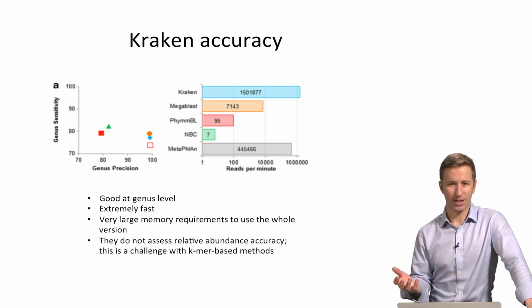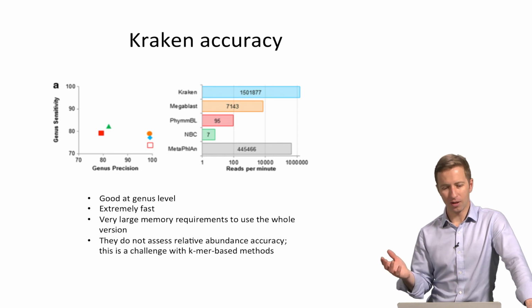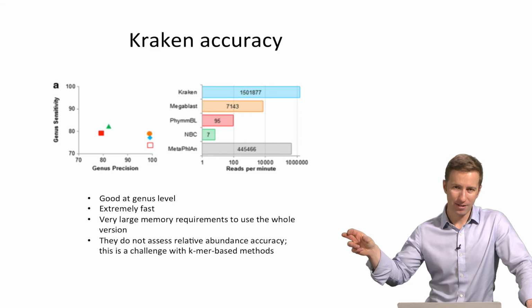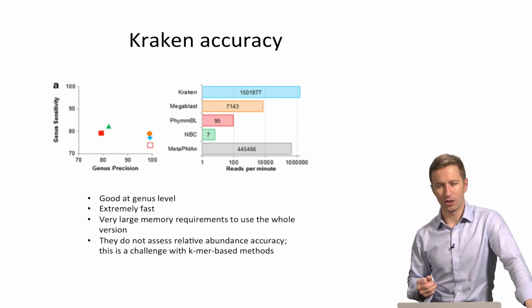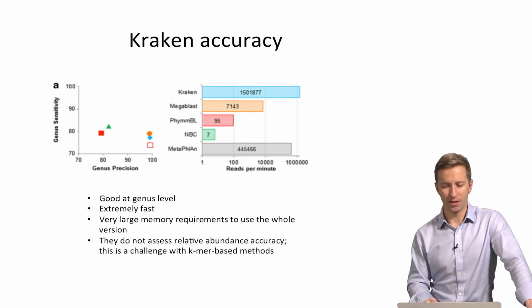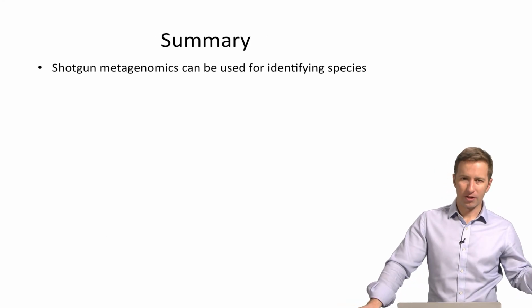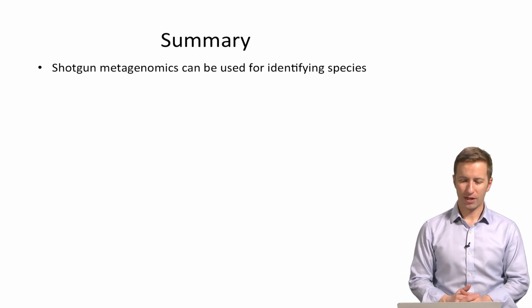It depends what sorts of tests you want to run. But I personally am a little concerned about the lack of specificity at going down to species level, and the lack of validation on the relative abundance information. On the other hand, it's super fast and very comprehensive, so it might work better in more shallow shotgun data than the other methods.